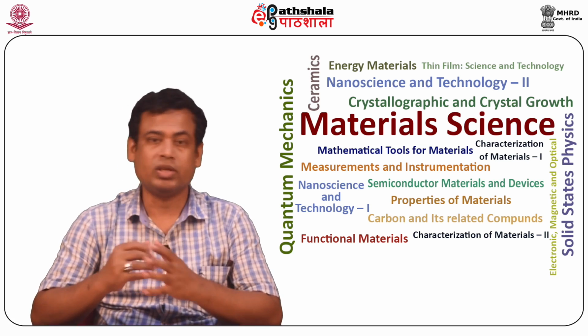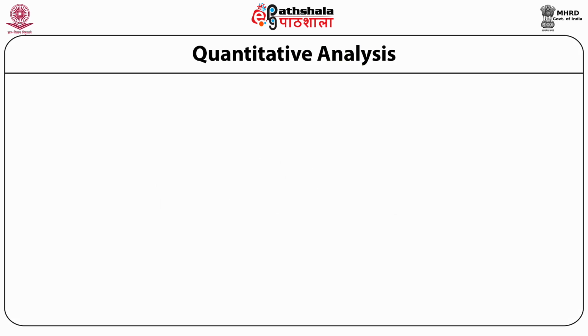The quantitative analysis. The quantitative elemental analysis of electron spectroscopy and X-ray spectroscopy are almost similar to each other.